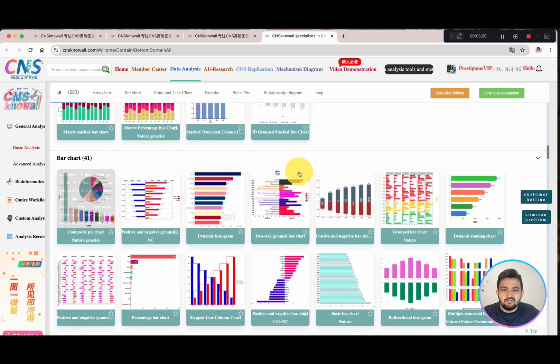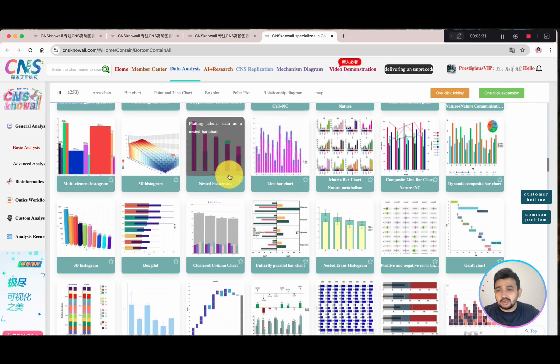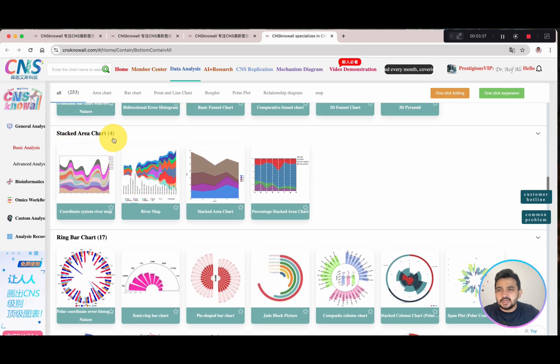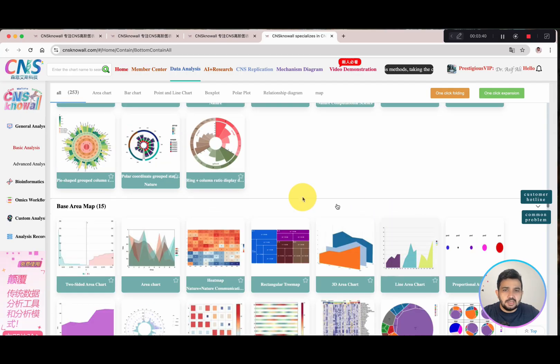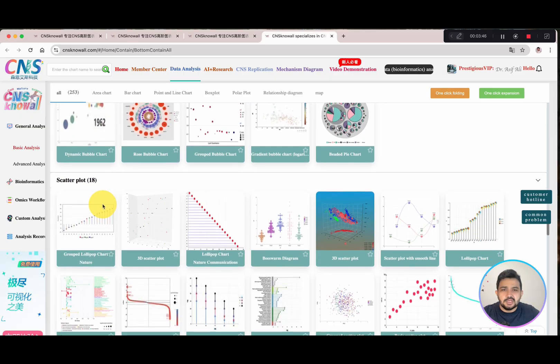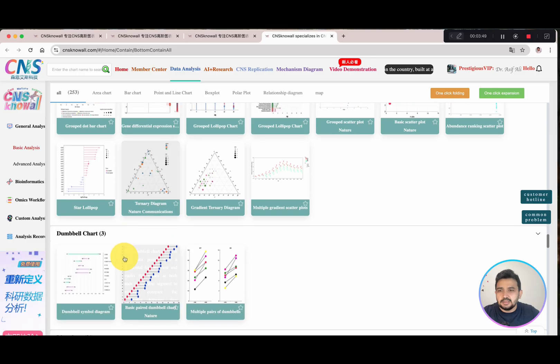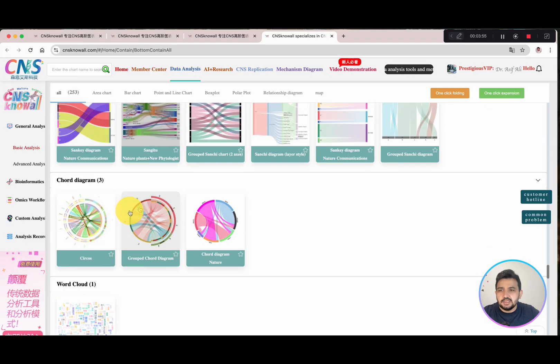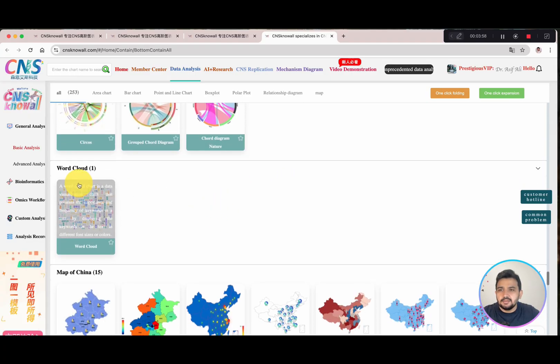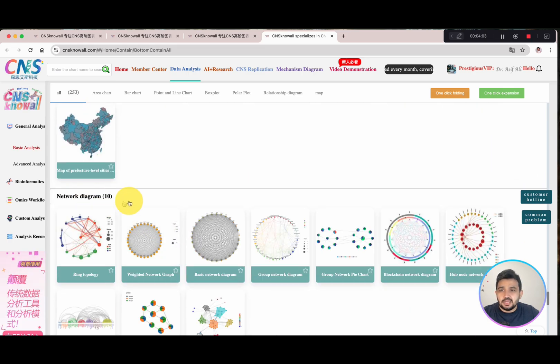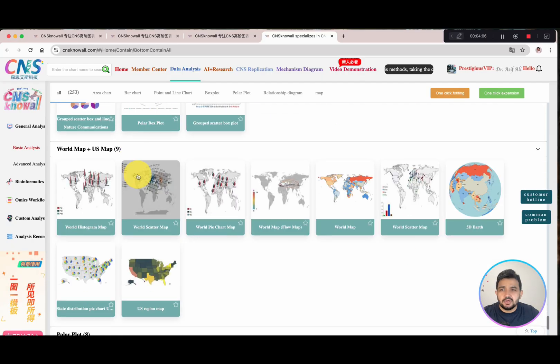Going further, we have bar charts, stacked area charts, ring bar charts, and base area maps. They also have scatter plots, dumbbell charts, and line charts. Then they have Sankey diagrams, chord diagrams, word clouds, and maps of China. They also have network diagrams, box plots, a world map, and a US map.